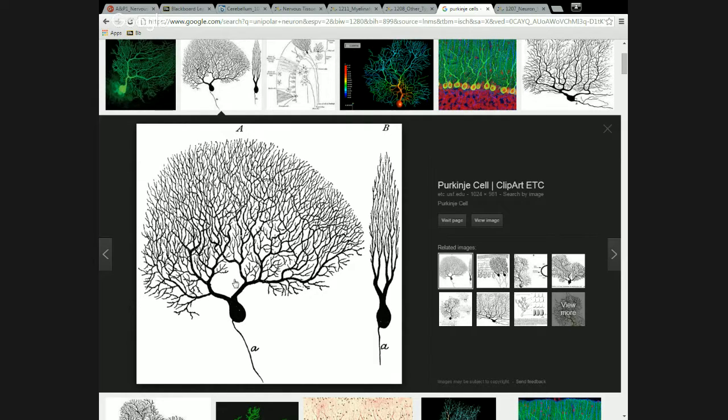He's actually a great anatomist, and there's a lot of things he did that tell us a lot about the structure of cells and the nervous system. But this is an example of that kind of drawing we would do. And it's 2 pictures of the same cell, one taken sort of head on and the other one from the side. So it has a very broad array of dendrites, but they're all kind of constrained into a narrow little band when you look at them from the side. Okay, so 2 examples of that. And then the A at the bottom here labels where the axon's coming out. This is sort of an old-fashioned way of doing it. Like I said, this guy did these things like 100 some odd years ago.